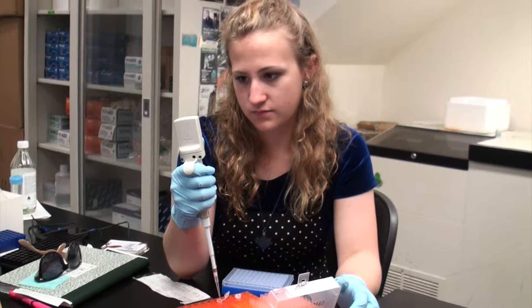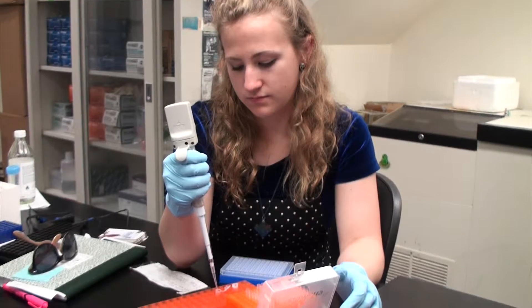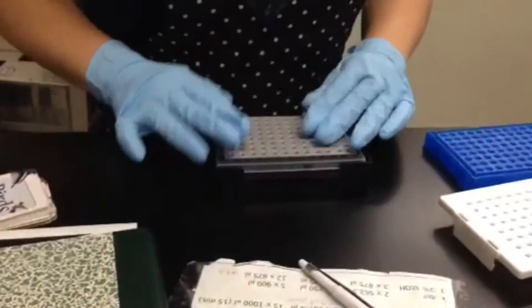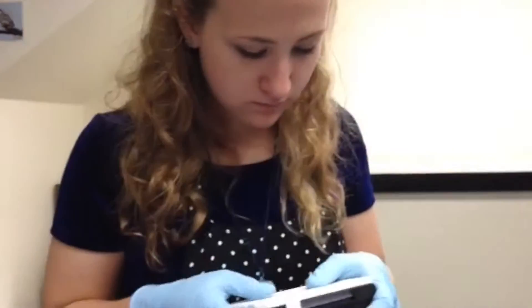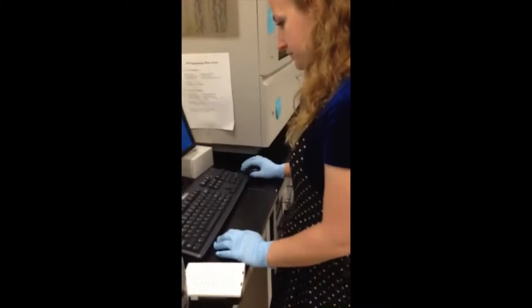We put 10 microliters of HiDi in for each sample, and then we can set up our 3730 process. We need to put a septa over our plate and place it into a container so that the 3730 will be able to read it.